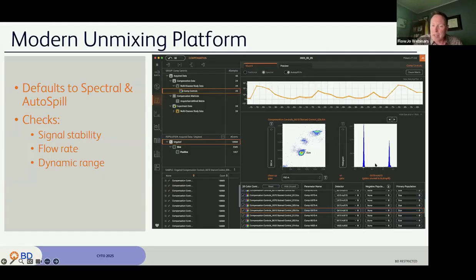And so you've got two plots down here, one that shows the cleanup gate for the selected sample. We've changed this, so now we're just showing one row of plots, and you can click through any one of the files and that will dominate what's in the plots here. I think that makes it a little more convenient, a lot less scrolling again. We were trying to do less scrolling for this version. You get a spectral plot. You can collapse or hide any one of these panels to make it fit your screen.